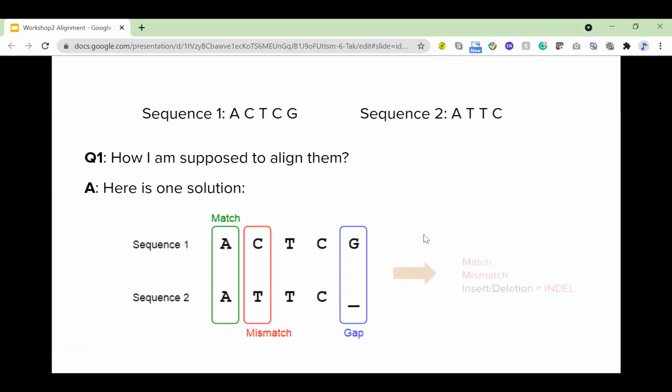Yeah, this is the terminology here. And we have two sequences, right? We usually call one of them query and another one reference. The reference, as I described before, is usually the thing in the database, because you obtained this reference sequence previously, and query is something you probably recently obtained from the lab or from your experiments. That's why it's called query. You might keep hearing this word in your worksheet, so it's just to clarify them.